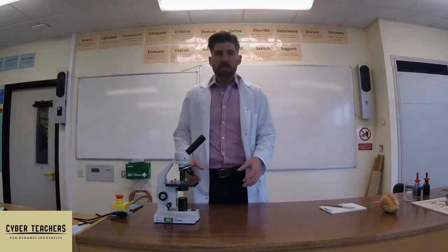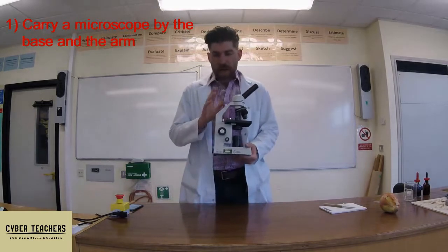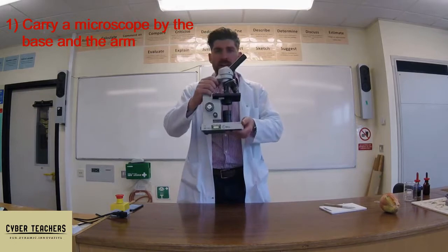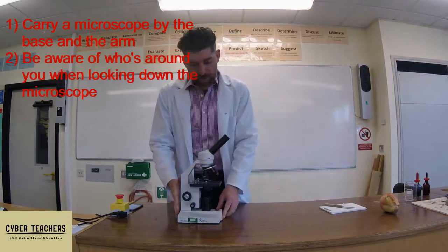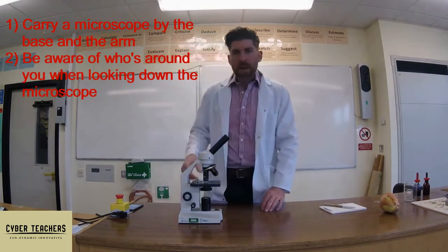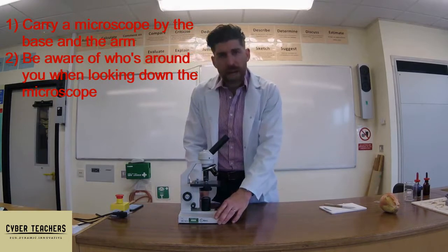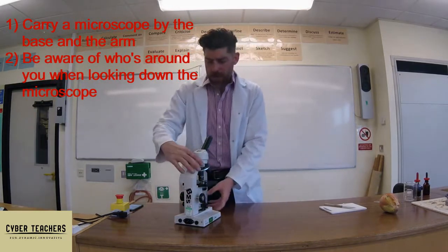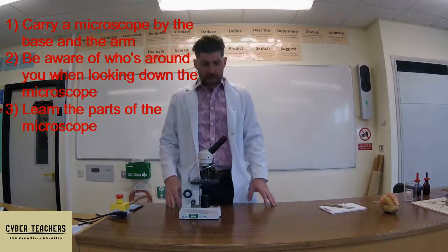Before we start, you need to know a few basic rules about the microscope. Number one: if you're carrying this piece of equipment around, you carry it by the arm and by the base — otherwise you carry it like this so you don't drop it. Number two: when you're looking down a microscope, make sure you're careful about who's around you, because if you get knocked from behind you're going to take your eye out.